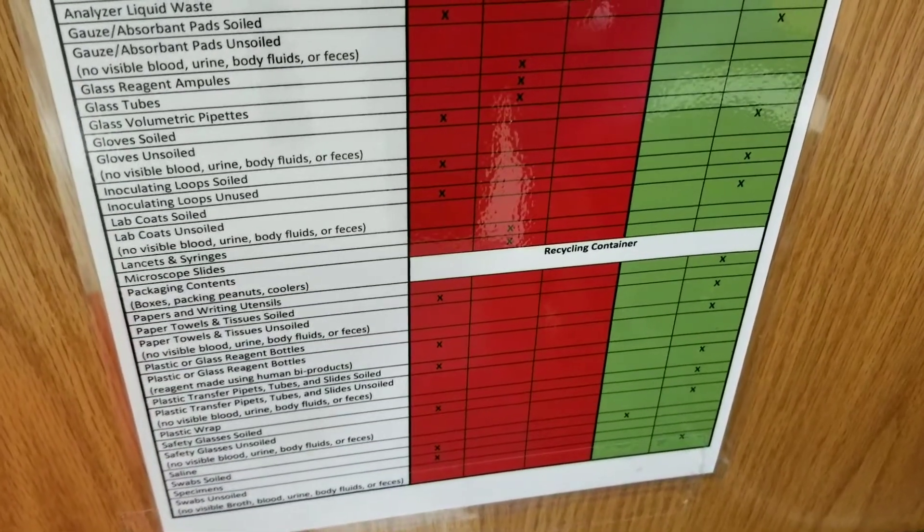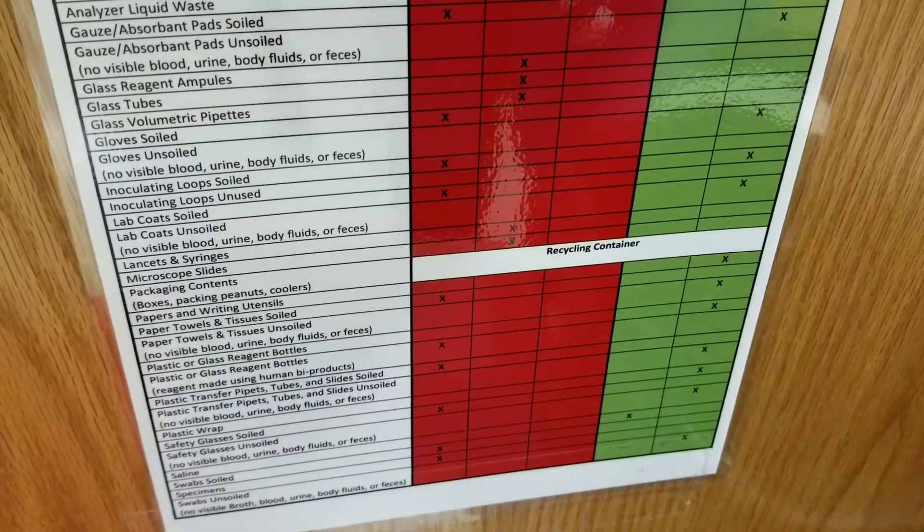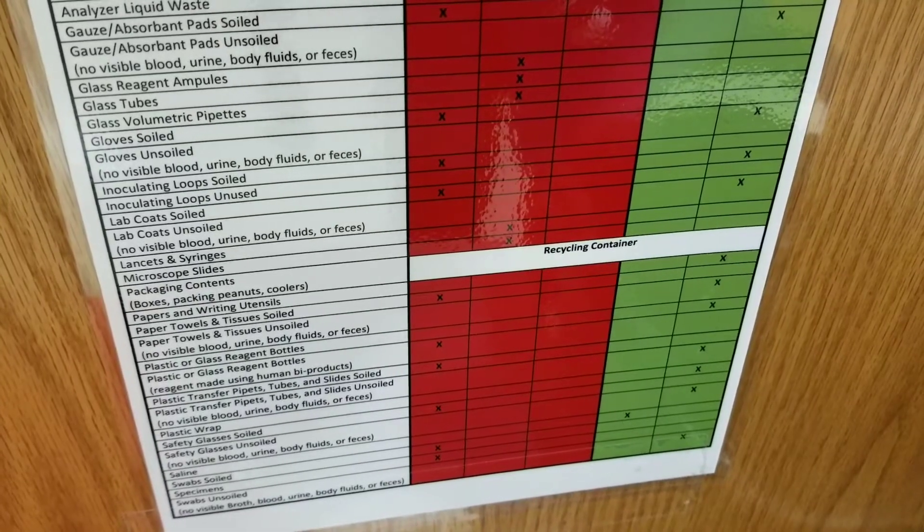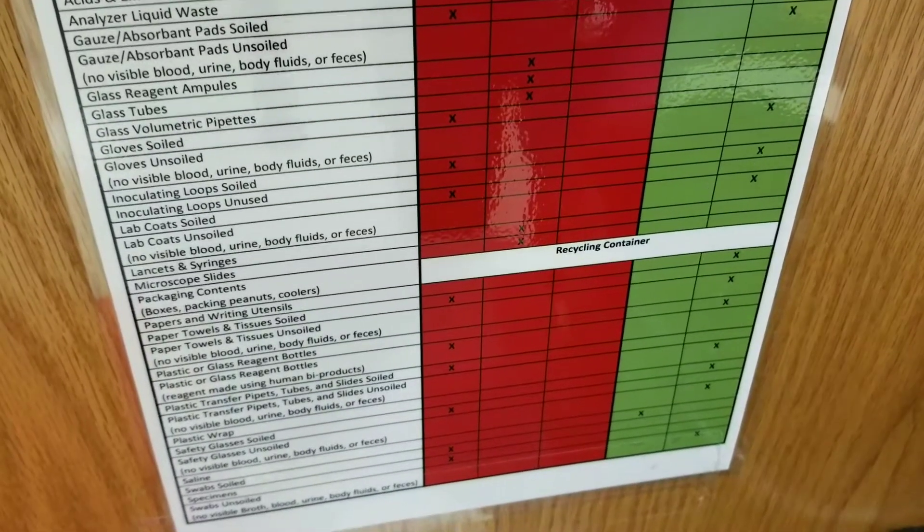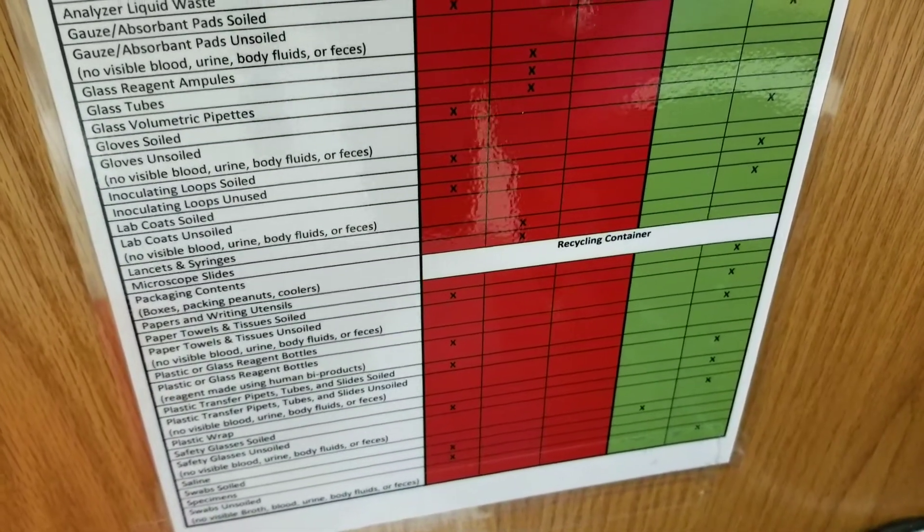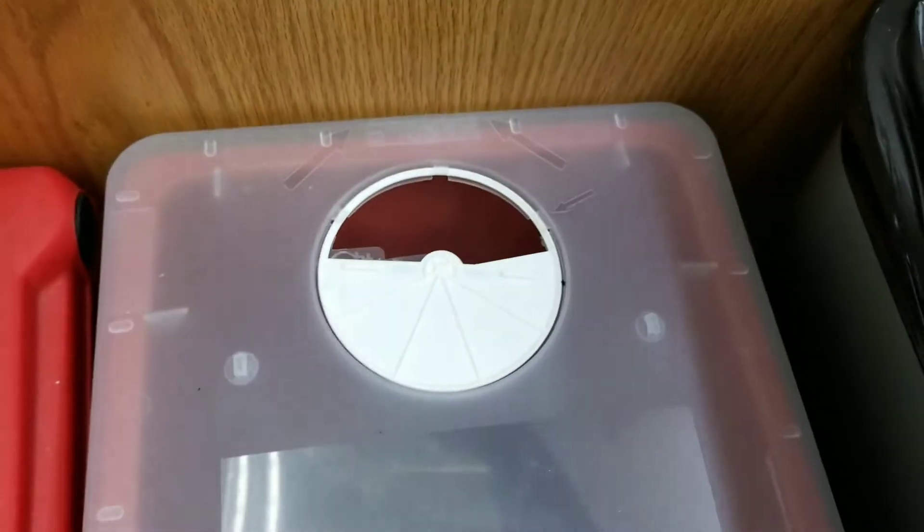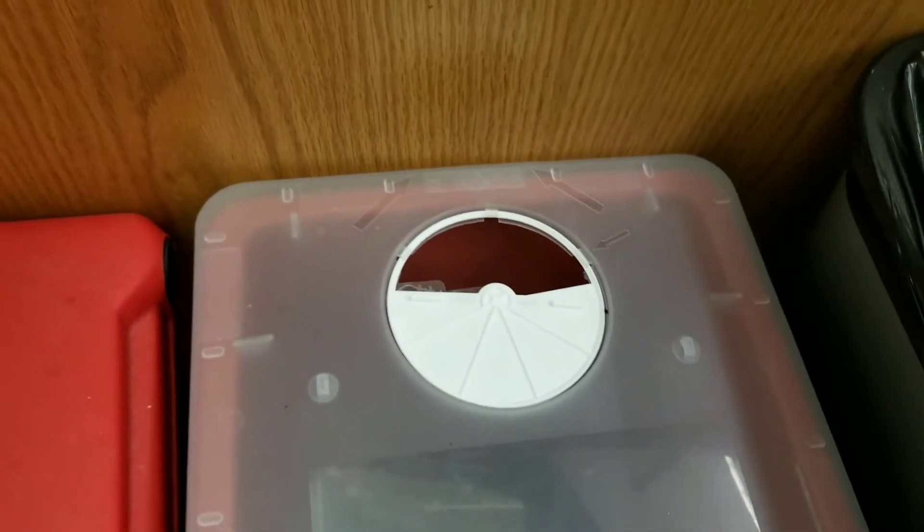So if you look on here, things like glass tubes, glass slides, microscope slides, all of those kinds of things will go into the sharps container.